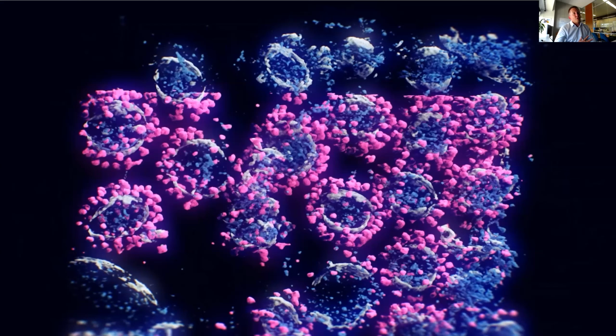Now we have a lot of denoised data, in terms of projections and tomographic reconstruction. So the learning process can be maybe even more successful, and maybe even the missing wedge artifact will be less pronounced. This is to be seen. So we have to use for our learning these newly reconstructed volumes instead of the old tomographic reconstructions.